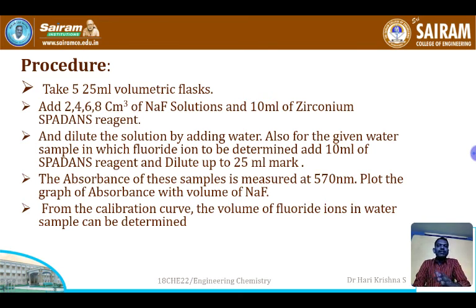So as we have seen, from 2 to 8, the volume of sodium fluoride is increasing. As the volume of sodium fluoride is increasing, the intensity of the color bleaching also will increase. So therefore, it is directly proportional. So absorbance also will change accordingly. Again, the test solution absorbance also will be measured.